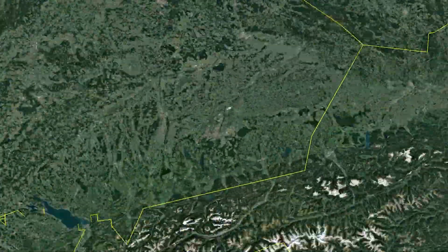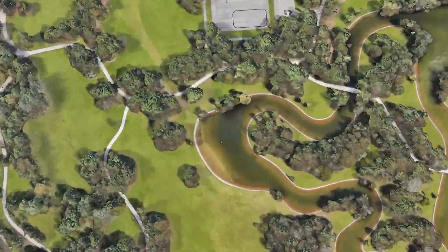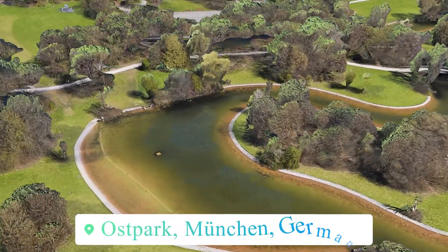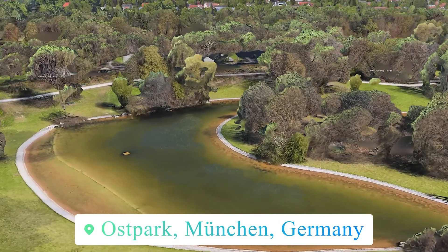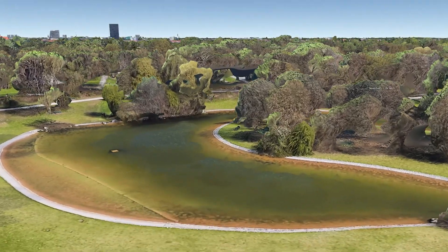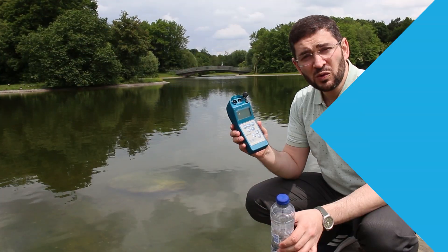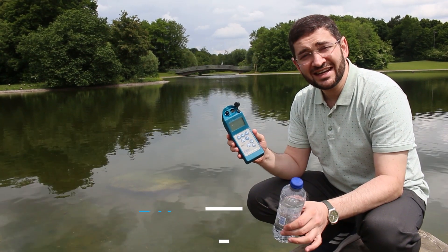Hello, I'm here in Germany, in Munich, and I just want to show you how to measure TDS of any water body using the TDS meter, which stands for total dissolved solids. Let's start together.